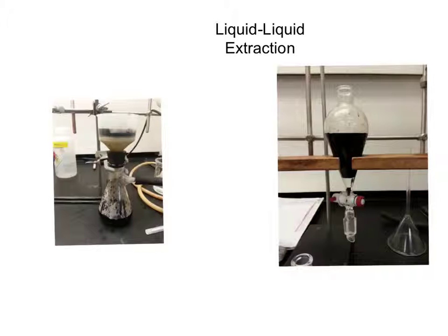We filtered it, which was a pain because the solution was thick and it clogged up the filter. However, when we got it done, we had a filtered solution of water and caffeine, which was really thick still. However, the main point was that caffeine was removed from the leaves, and it was in an aqueous solution.